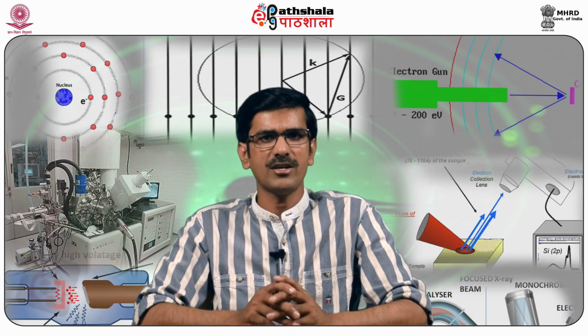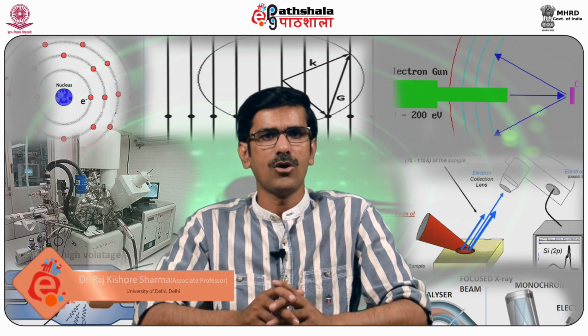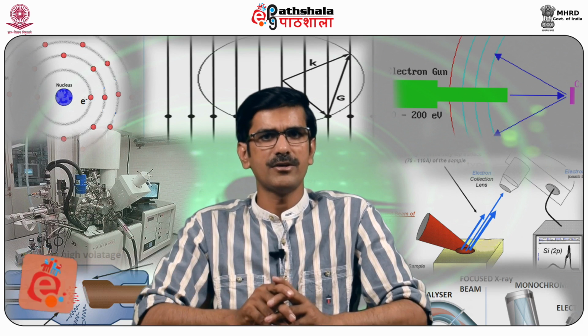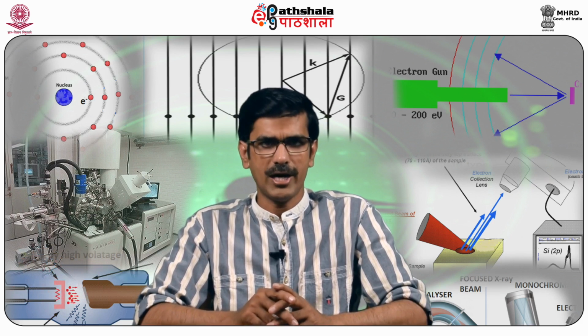The photoelectric effect is the emission of electrons or other free carriers when light is shined onto a material. Electrons emitted in this manner can be called photoelectrons.